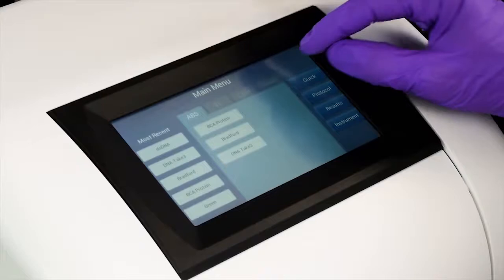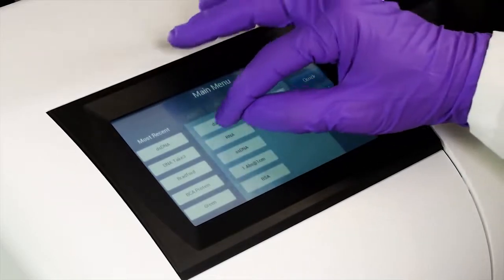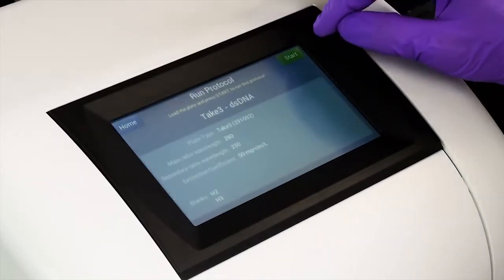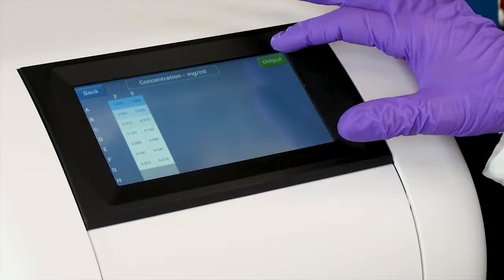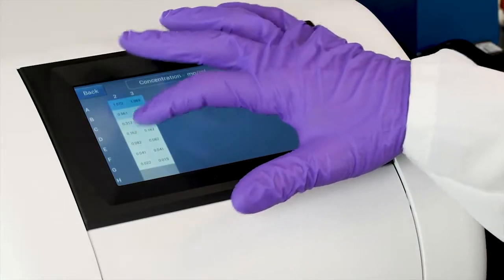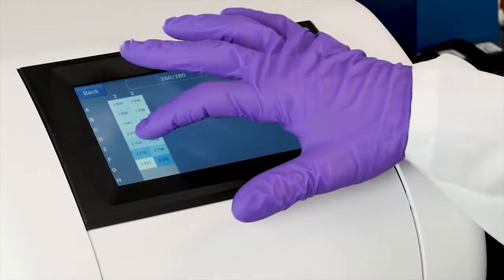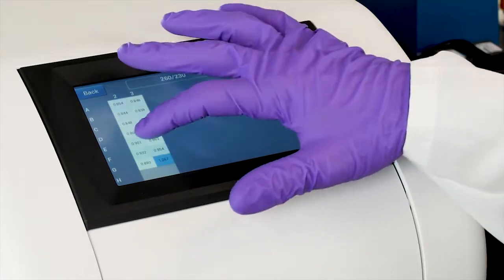Pre-programmed nucleic acid and protein protocols in Synergy LX display immediate results for up to 16 2-microliter samples. Results are displayed immediately after the read and can be exported to the USB stick for use in other analyses.